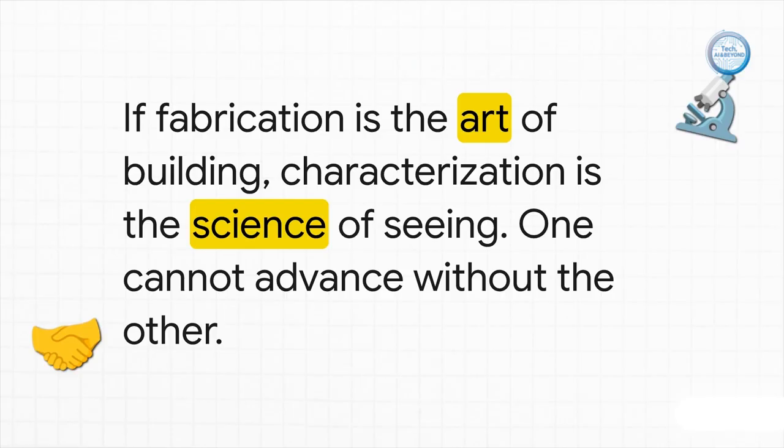That's a perfect place to wrap up. So, to summarize, we learned today that nanotechnology simply cannot exist without characterization. To get past the limits of light, scientists need a powerful toolkit. We have electron microscopes like SEM and TEM to see surfaces and internal structures. We have tools like AFM that can literally feel the atomic landscape. To find a material's identity, we use XRD for a crystal fingerprint and spectroscopy for a chemical one. And to understand how they'll actually work, we measure surface properties like charge with zeta potential and area with BET. Most importantly, as you just explained so well, no single technique tells the whole story. A complete picture only comes from combining all the clues from this advanced toolkit.